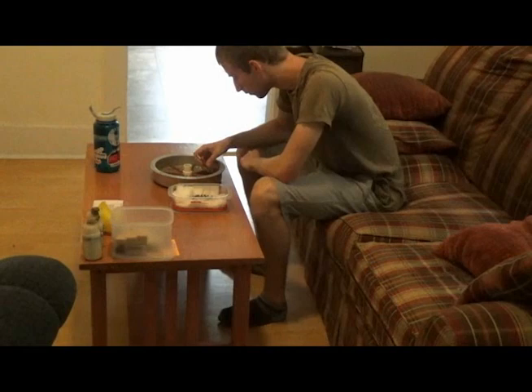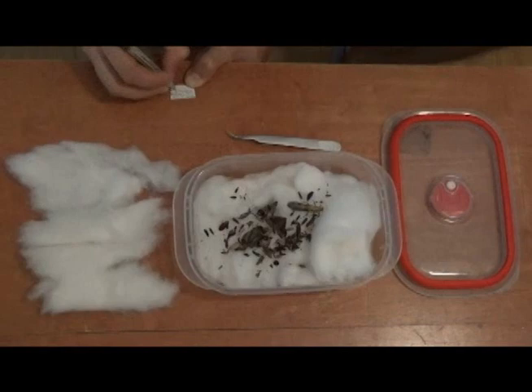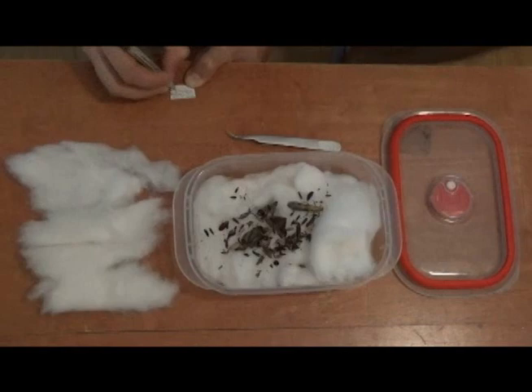An important detail for any scientific collecting is to remember to write down collecting data, such as location, date, habitat, and the names of the collectors. I can now put them in a freezer. I'll demonstrate how to relax and spread moths in a separate video.